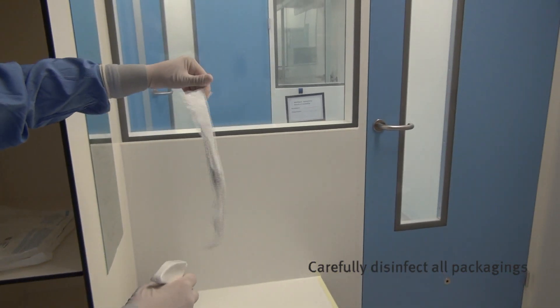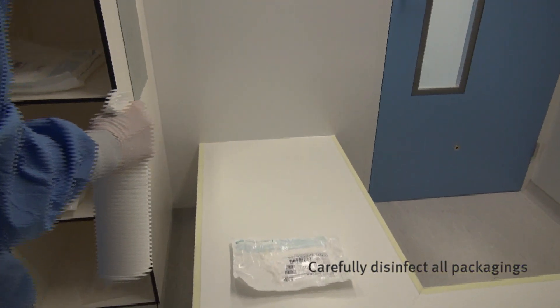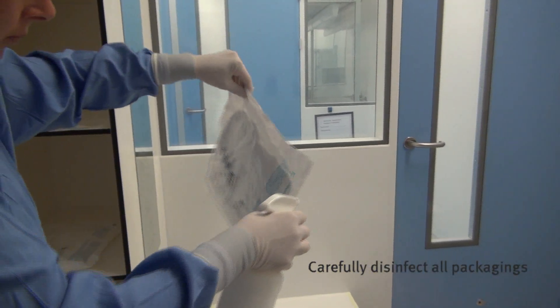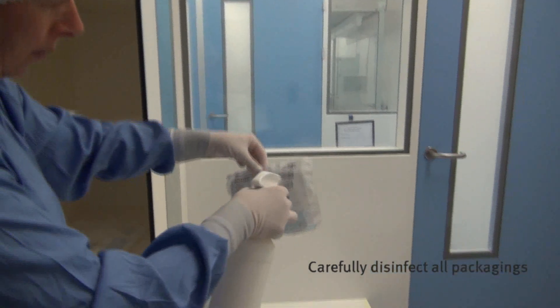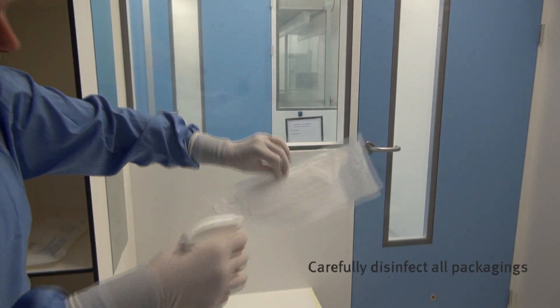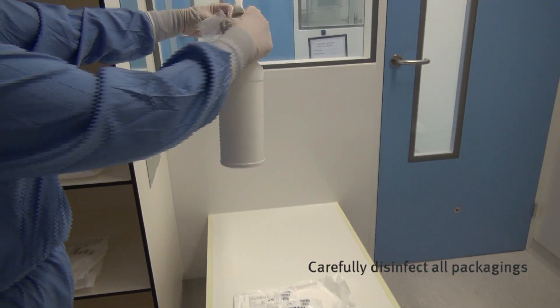Disinfect the packaging of all required materials: the Tyvek ISOClean boot covers, the Tyvek ISOClean coverall, the Tyvek ISOClean hood, the sterile face mask, the sterile goggles, and the second pair of sterile gloves.